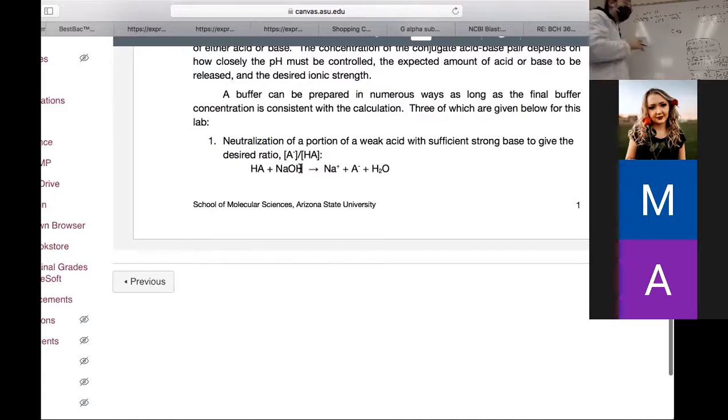That's basically how you calculate this part. With that being said, you know how much weak acid you need to add and how much strong base you need to add. The next step for making a buffer is you mix these two components together, and you add water, bring the volume to 50 ml, and that's it. That's method 1, how to make this.